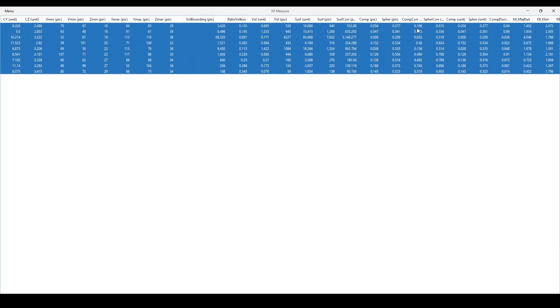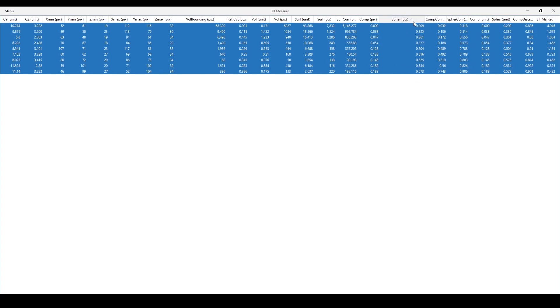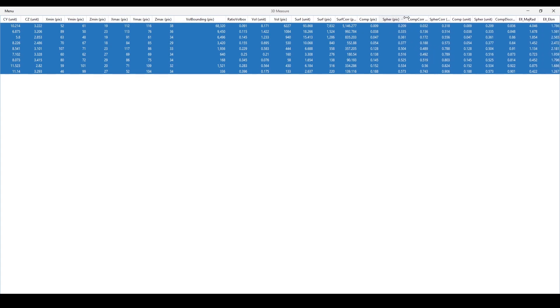This output is very similar to the data from the mitochondria analyzer, but it gives you a little extra mathematical information with all the ratios it calculates. For example, the ratio of a mitochondria volume to an elliptical shape can help you understand whether your mitochondria is more round — closer to a circle — or whether the shape is more close to an elliptical shape.